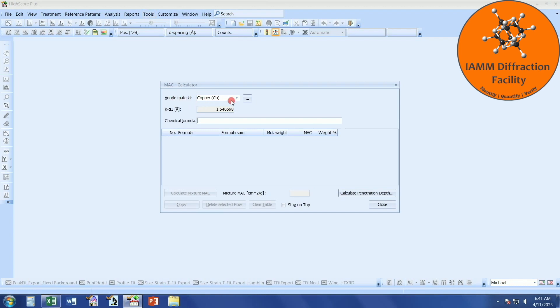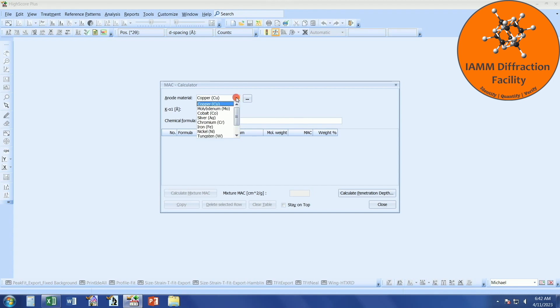Here, we can see that we can choose whatever anode material we are using for our x-rays, such as copper, moly, cobalt, whatever. We typically use copper in the lab, so I'll stick with that.